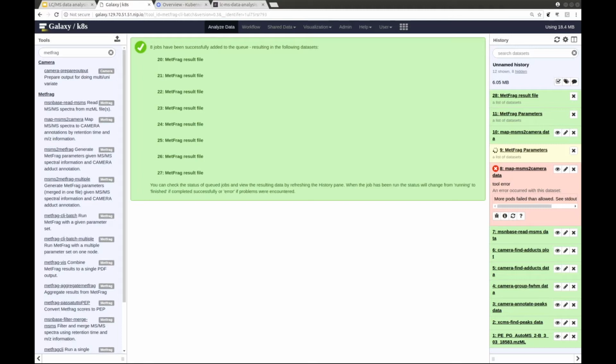And I'm pretty certain that your data protection officer at Imperial College would do very nasty things to you if you uploaded patient data to the Galaxy server in the United States. This is why you can fire up your own Galaxy that is dedicated to you, and nobody else has access unless you provide an account. You can even run that on the OpenStack cluster in the basement of the hospital. That's the reason why we focus on doing that on the cloud.